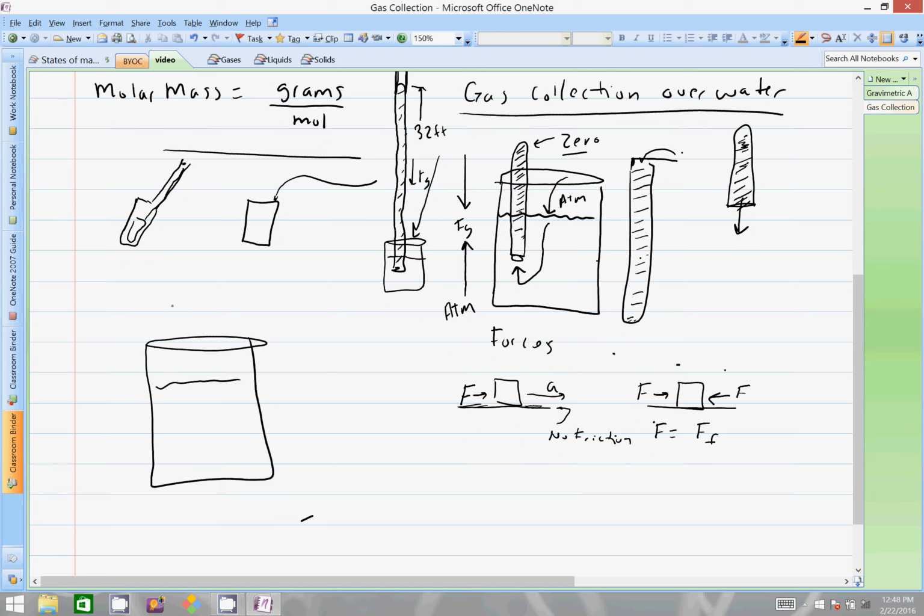Then we put the tube back on; the tube just slides on. Then, usually with a partner, because you don't want this thing to get wet. The masses of this lighter are so small, you want to keep that lighter dry. So bring the lighter pretty close.